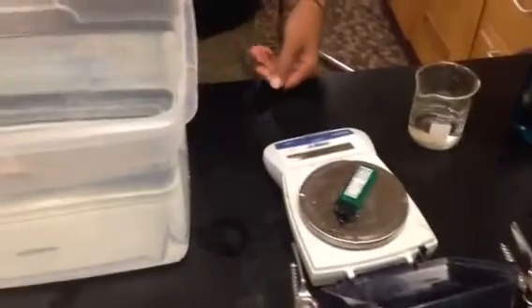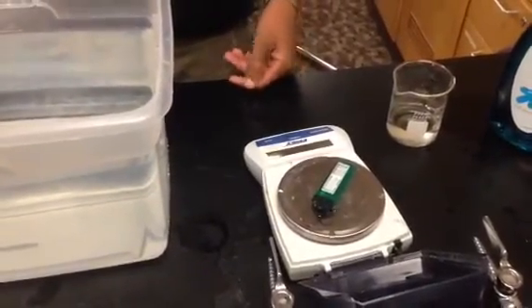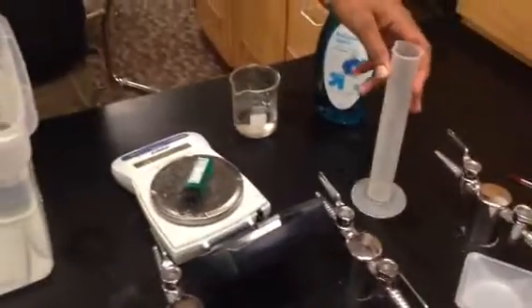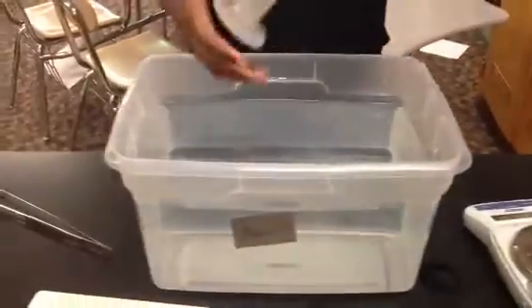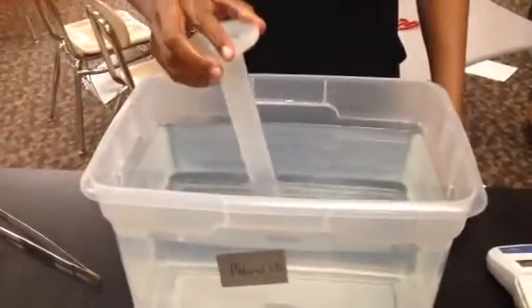So whatever that number is, you're going to record that in your data table. Go ahead and leave that there for a little bit. Now take your graduated cylinder, put it into the water, and you're going to put it so that it completely fills up with water.